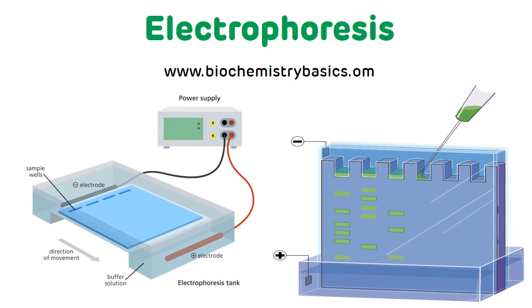Hello everyone. Today we are going to discuss one of the important techniques which is used for the separation of proteins in clinical laboratory, that is electrophoresis.